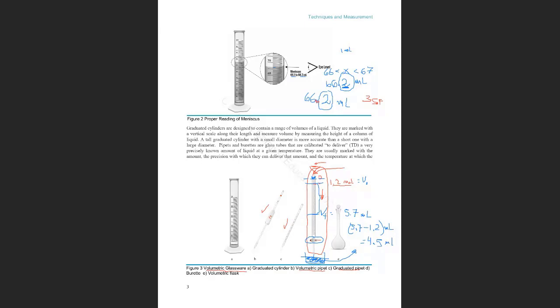And this is a volumetric flask, which also has a line, and it will tell you we have 25 mL, and bigger ones of 50 mL and 100 mL. What you know is that if you use that piece of glassware, you are going to have good accuracy. So we use it when we really care that what we measure is as accurate as possible. Any questions?